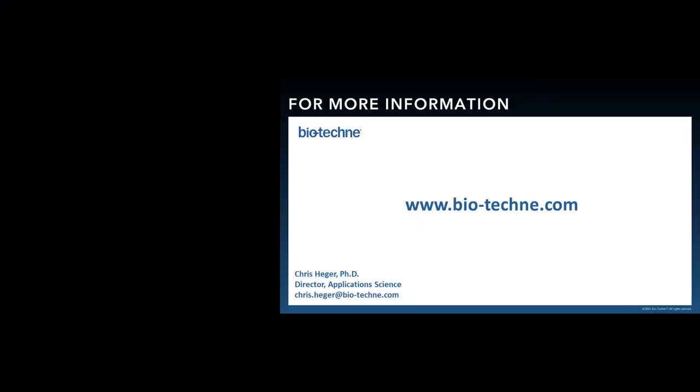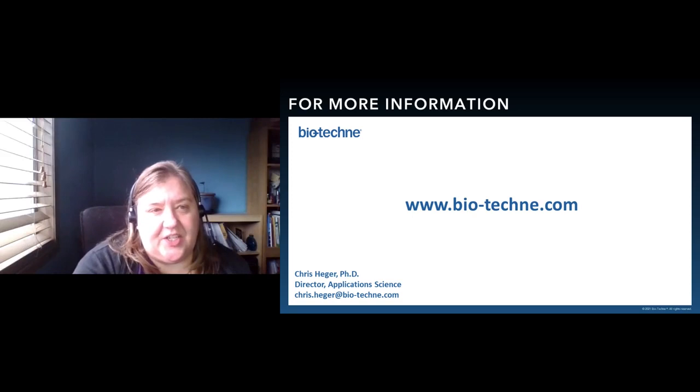Okay, thanks, Chris. So the first question is, the isoelectric focusing data is interesting. Any comments on what the peaks are exactly for VP proteins? I had expected just 3 peaks, one corresponding to each.